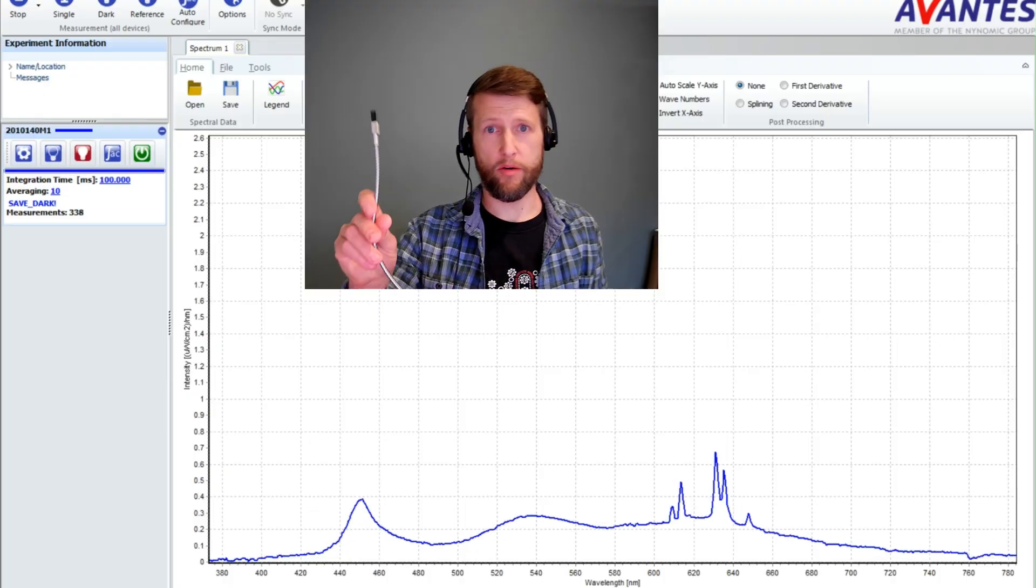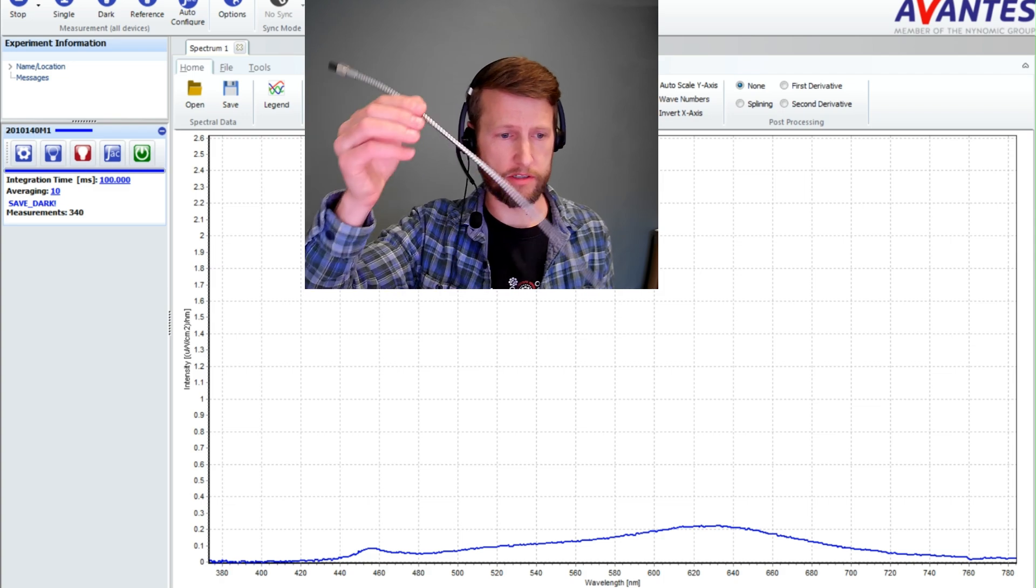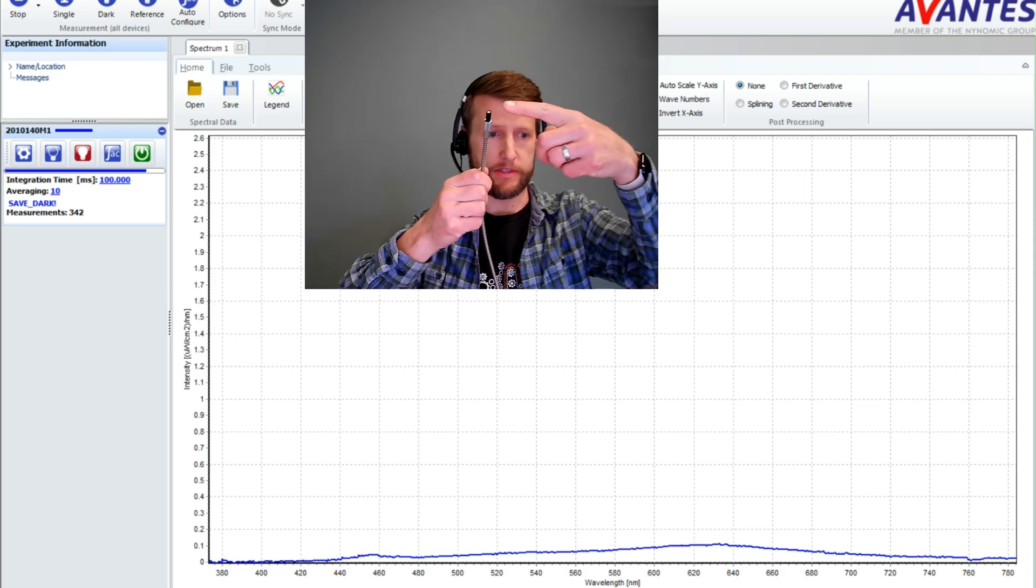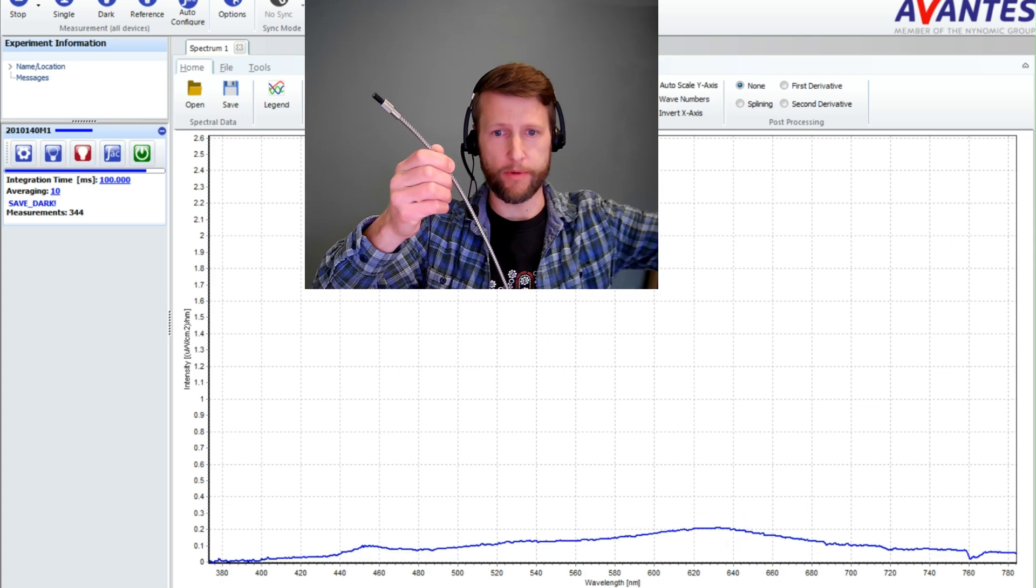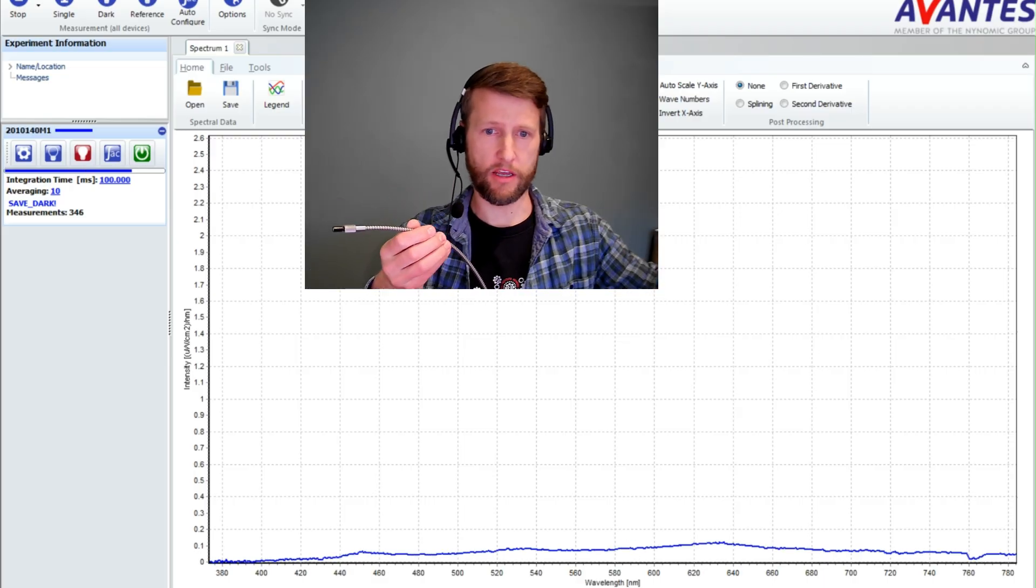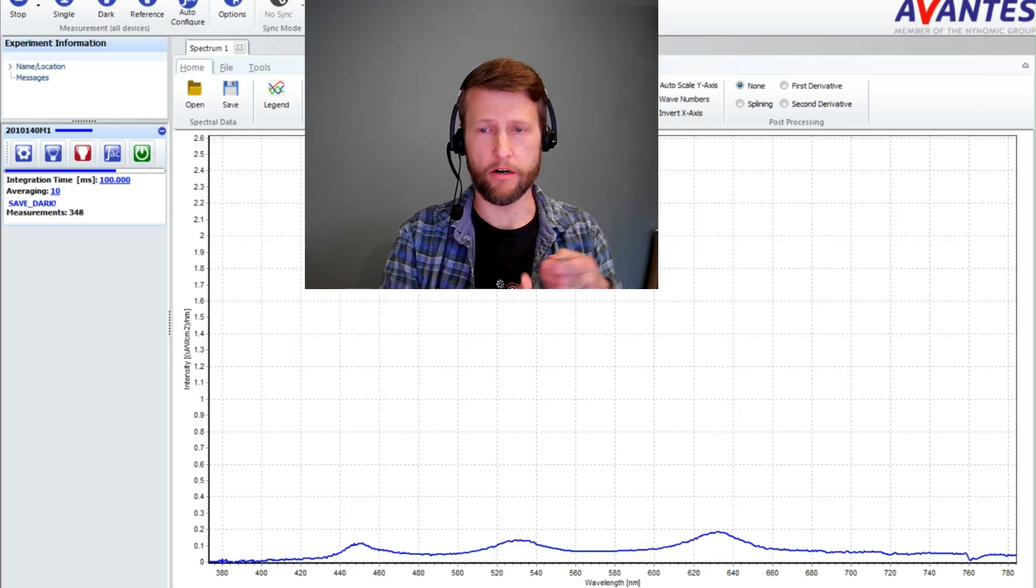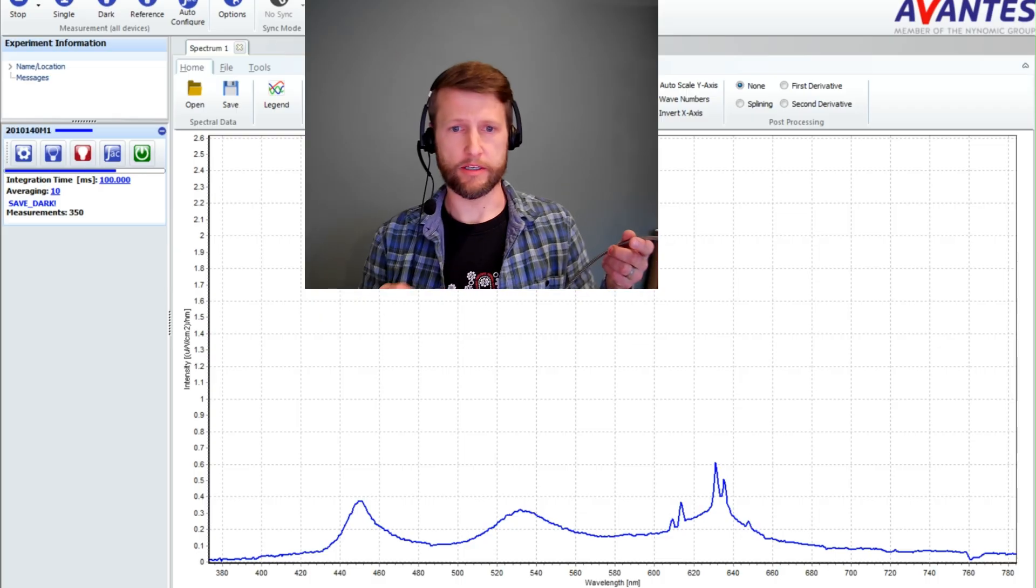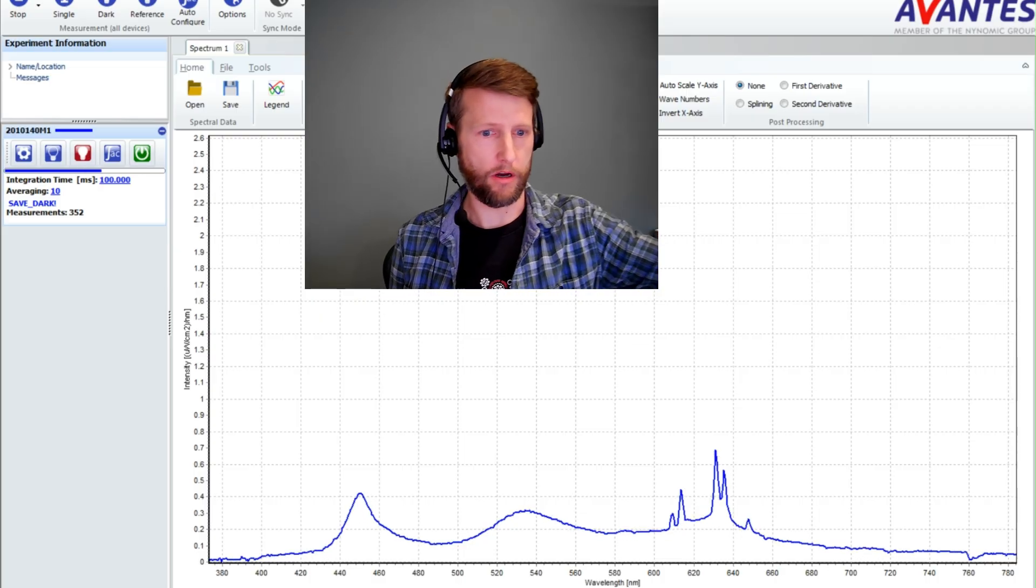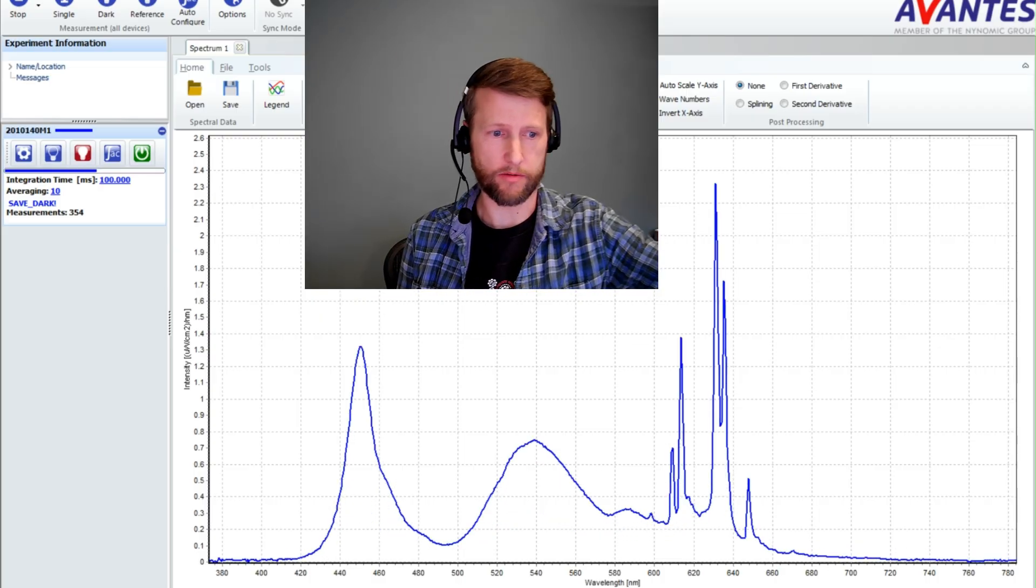So I'm going to show you now how my USB spectrometer works. This is a fiber optic spectrometer. The light comes in the end here, goes to my spectrometer which is USB connected, and you're seeing on my second monitor here the actual spectrum that I'm measuring coming out of the spectrometer, out of my screen.